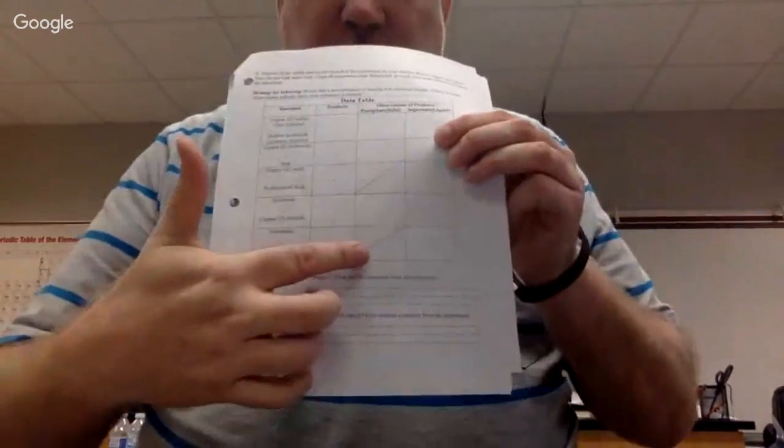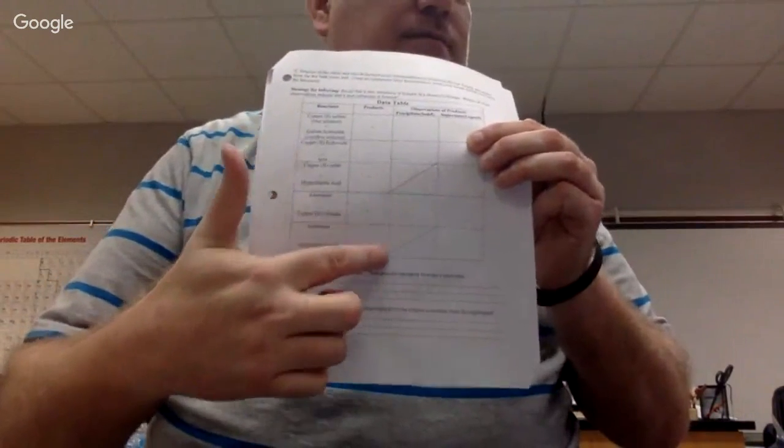Hydrogen gas. You know how we know we have a gas? Bubbles. You're going to see bubbles. Do you notice how on the back on the chart here, there's a space with a line through it? That line through it means that you're not going to end up with a solid. In fact, you're not going to end up with a liquid either, but I didn't want to change the whole heading. You're going to describe what the gas is in this space.